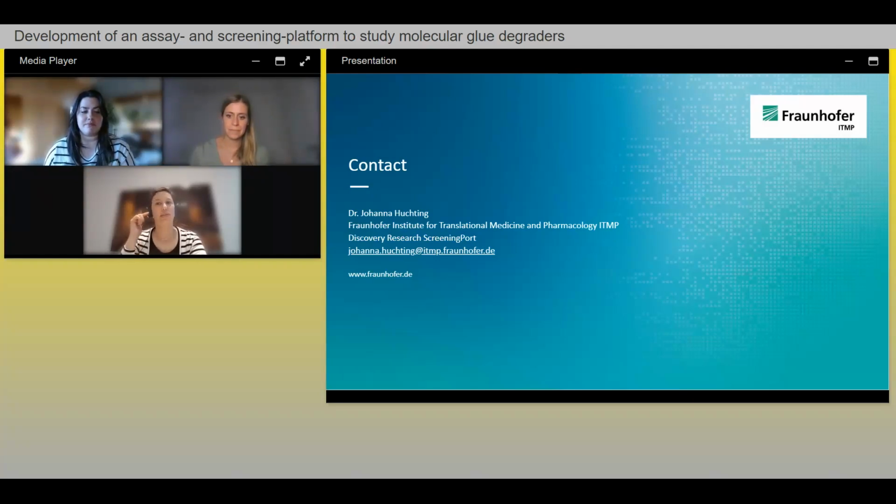So as I've shown, we detect interfering compounds in the donor channel, for example. So those are compounds that absorb fluorescence that we want to read. And so it's chromophore compounds, colored compounds that would interfere with any fluorescence-based readout type assay, I would say. So those I would flag as interfering compounds here.